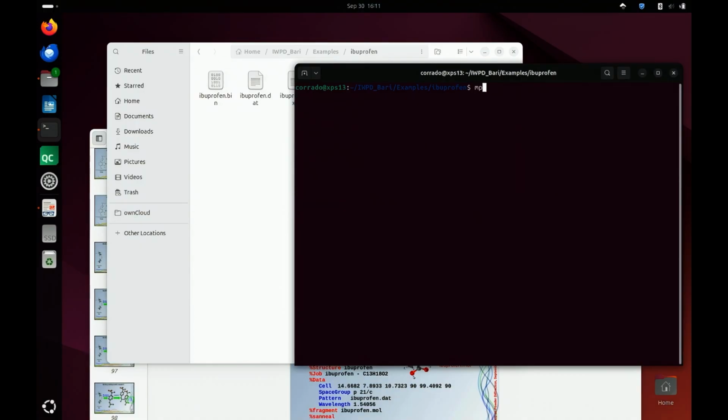You can run the parallel version of the program. I will explain the parallel version in more detail in the next slide. To run the parallel version on Linux, first of all, you have to specify the launcher. The launcher typically for an MPI application is mpirun.